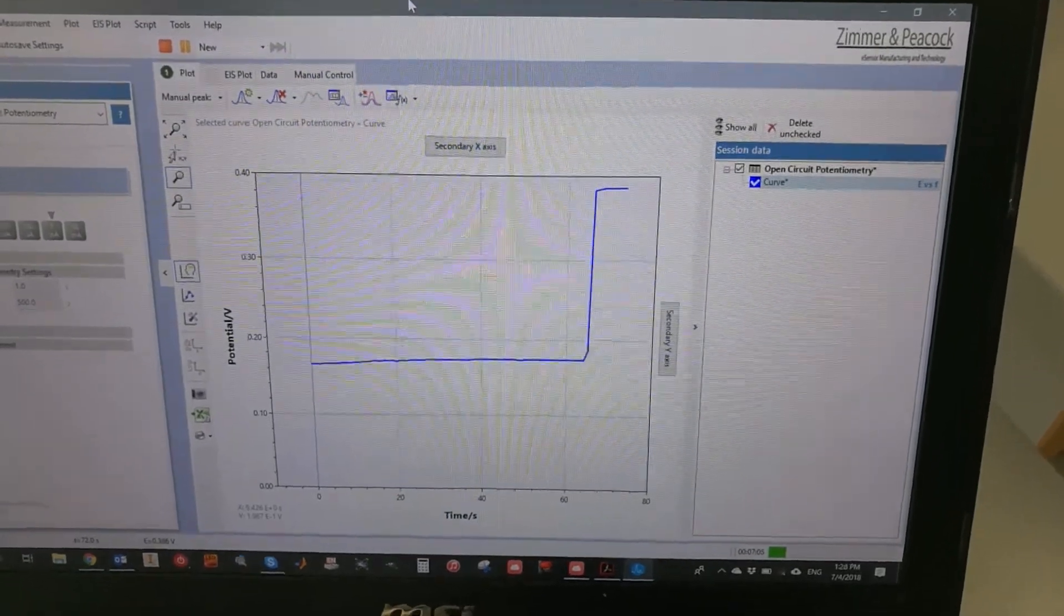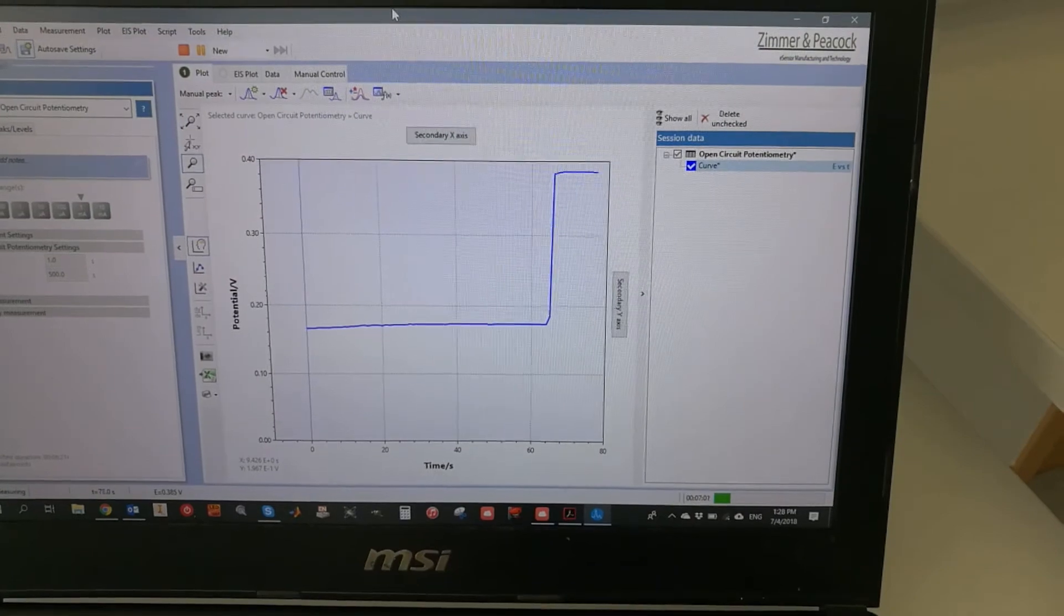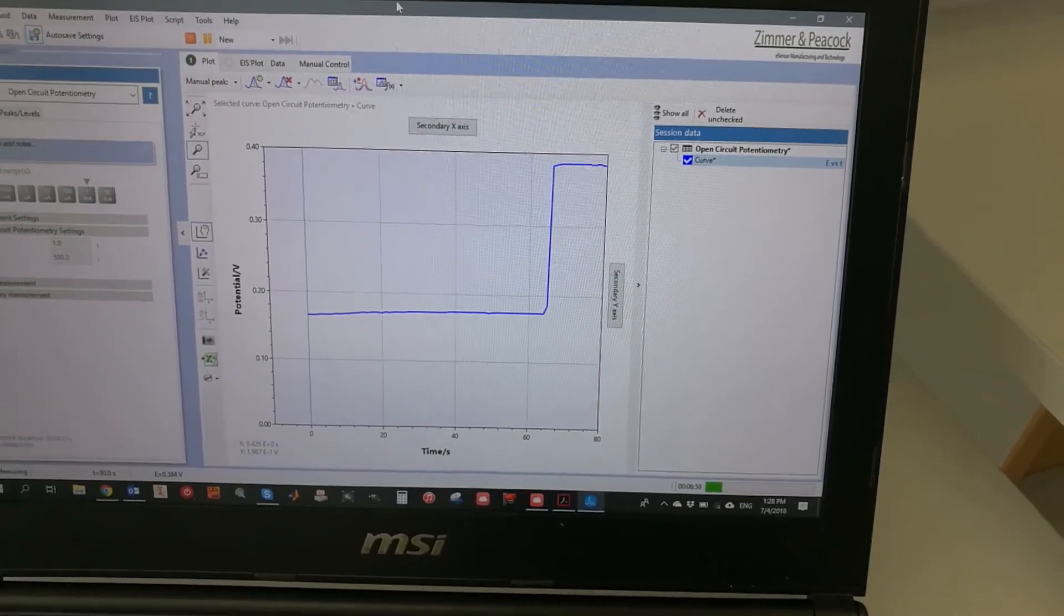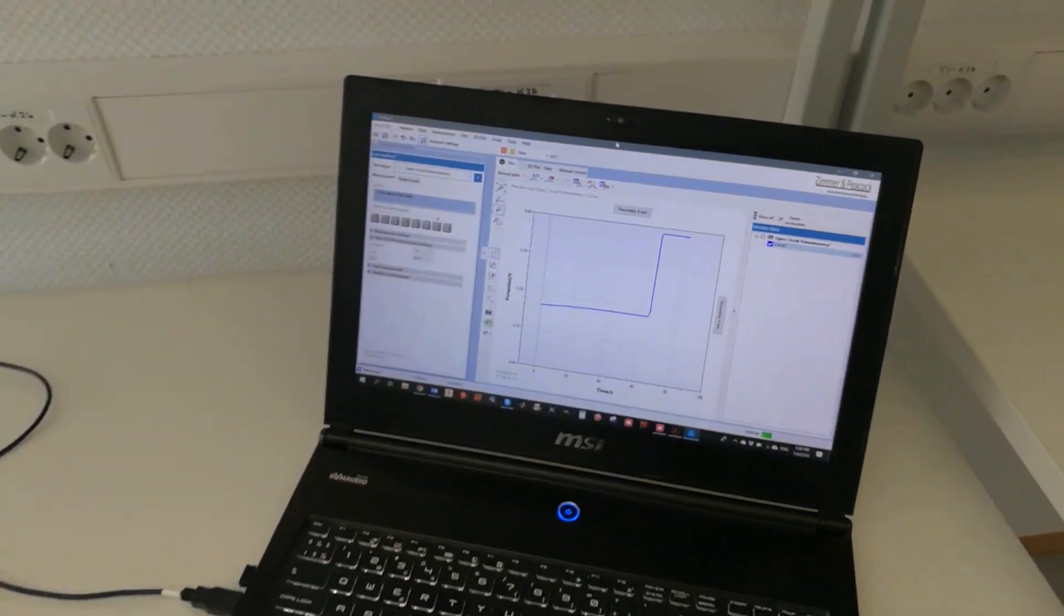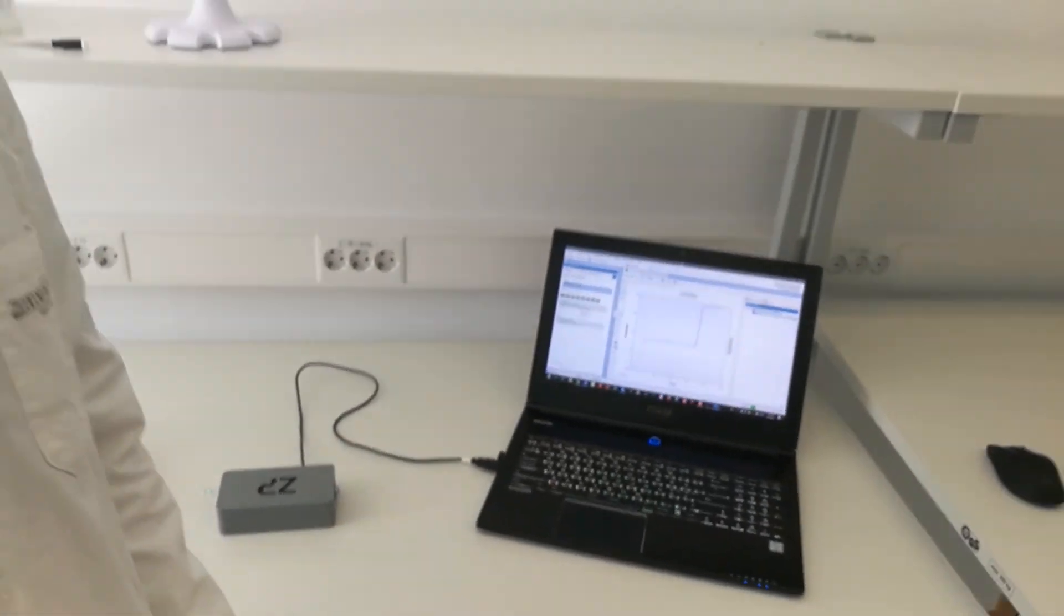This is how we test. You would have to account for the volume if you want to try different concentrations or lower concentrations. I hope this helps you in your testing. Thank you.